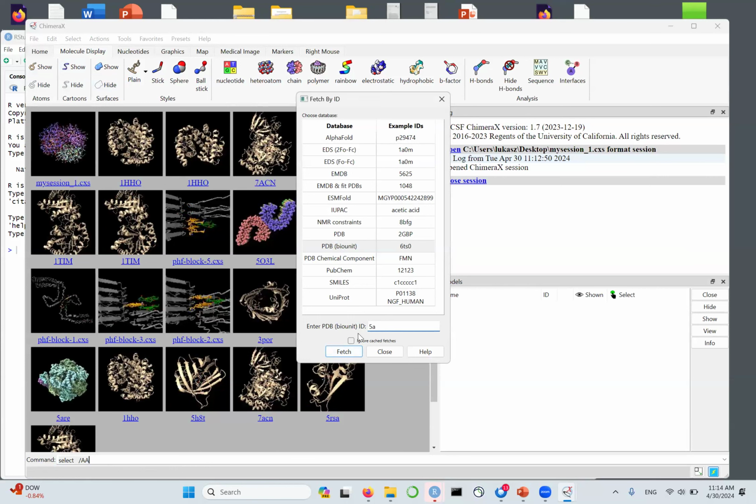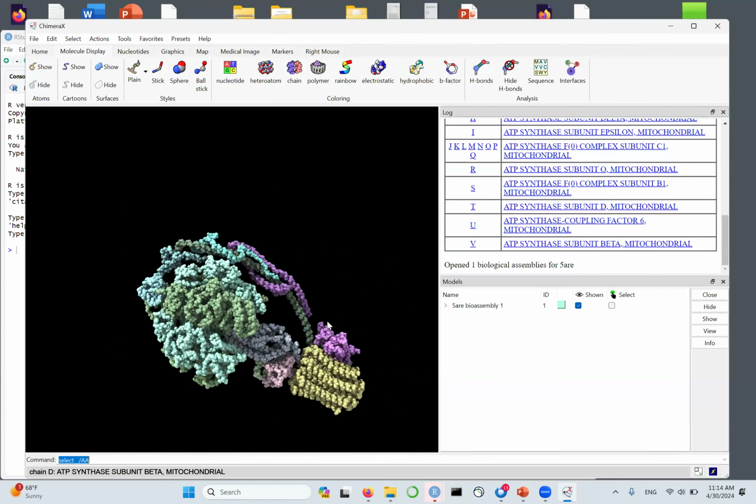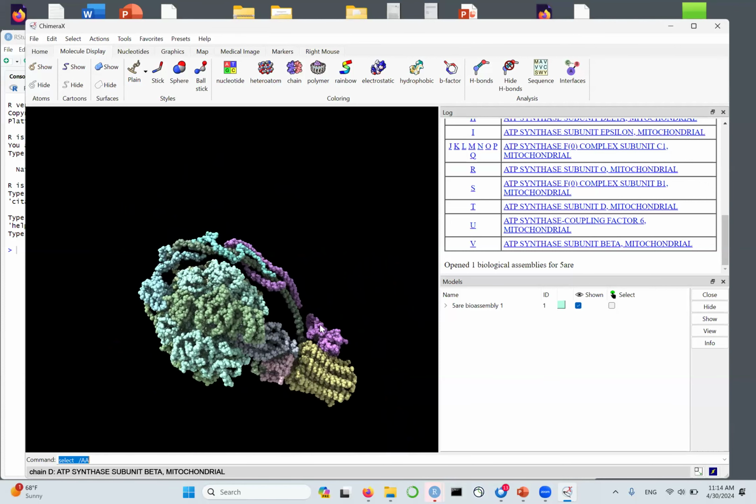Let's say, here's another one. Here the molecule was shown by default in a different representation. Here we see a space filling model. Looking at the models before, you thought the protein is empty. There's mostly empty space with those tiny, tiny sticks around. Actually, protein is pretty well packed. There's not much space left between the atoms.